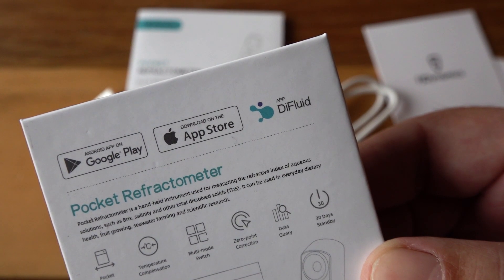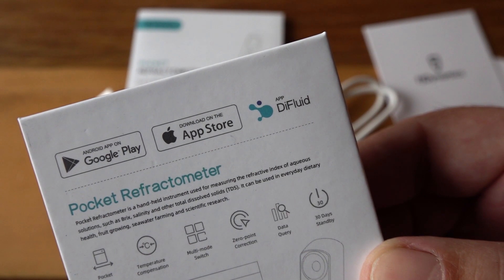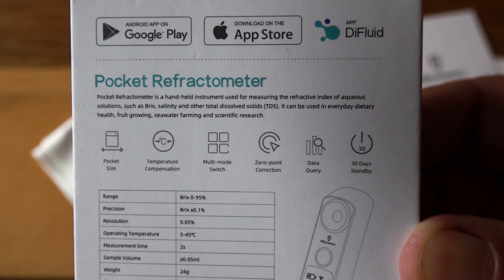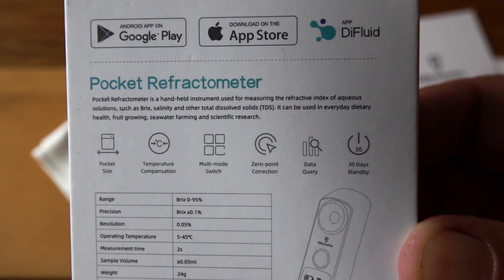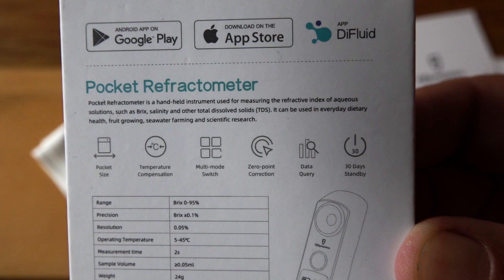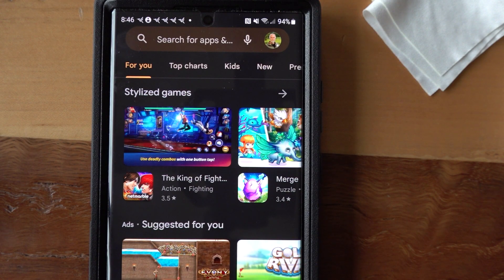You need an app — that's right, you're going to have to use your phone if you want to use this pocket refractometer to determine the water percentage of your honey. They say it features pocket-size temperature compensation, which means it adjusts its temperature so it reads correctly, zero-point correction so you can zero it out with distilled water, and supposedly 30-day standby power if fully charged.